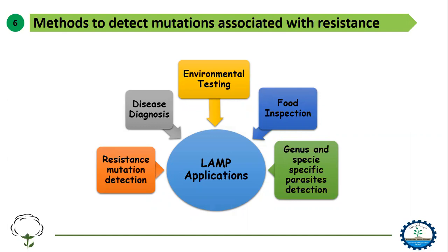This application has been used in genus and species specific parasite detection. But I focused on the resistance mutation detection because this kind of smart approach is very much required in our area, because we don't have the sophisticated equipment for this kind of application. So LAMP application is very much relevant for resistance monitoring.